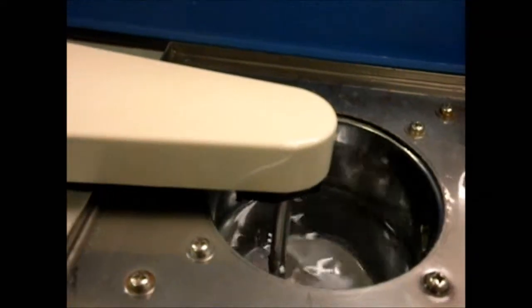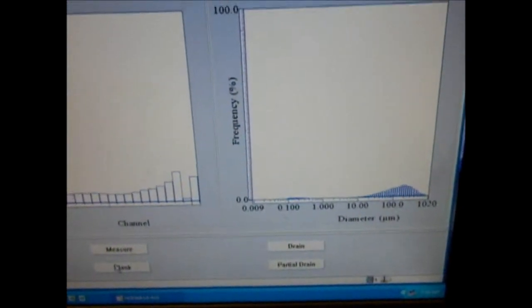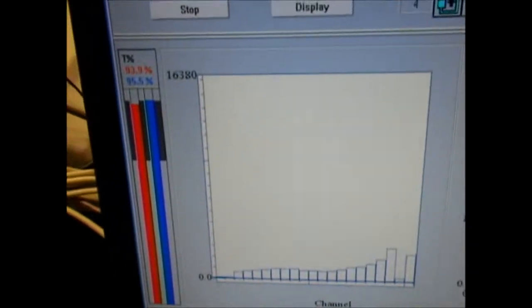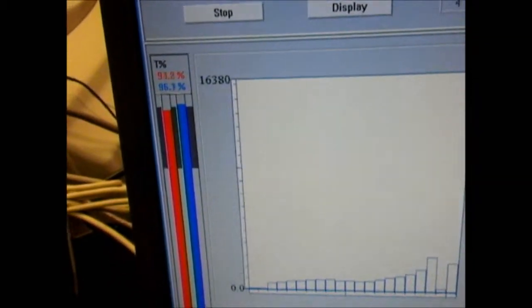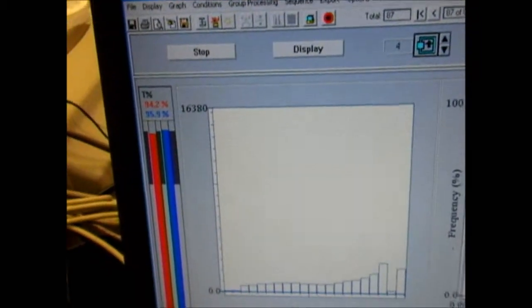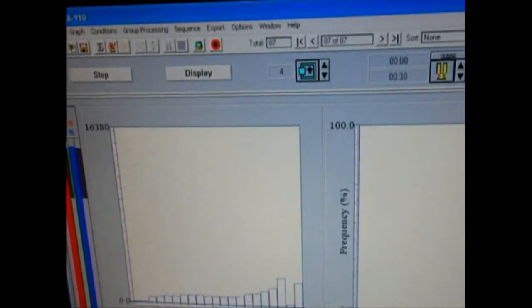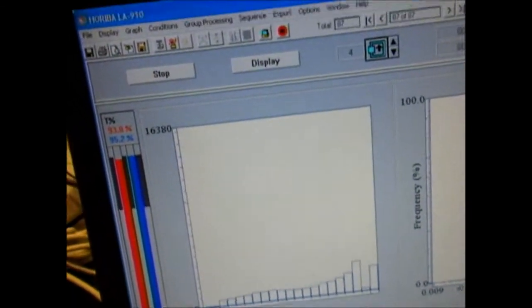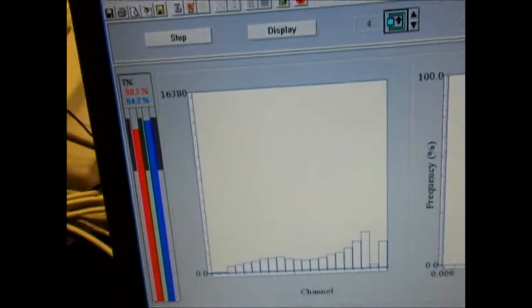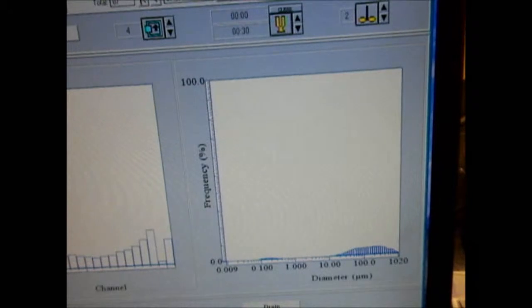You want to make sure the sample is well mixed, and then make sure the counts are fairly low — the red and blue bars should be below the 95% level. I'd like a little more sample, so I'm going to introduce more into the circulation bath. This percentage should drop a little more. I think I've got a fairly stable background right now.